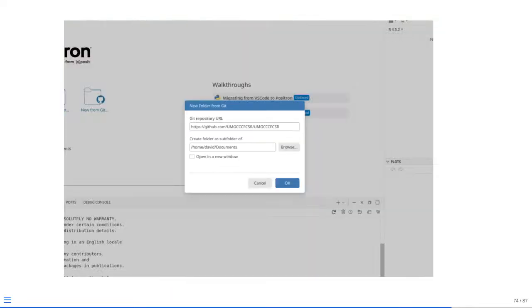And we will proceed to copy and paste that into the GitHub repository URL. The main important thing is you need to decide where you want to keep all your different R project folders, because you're going to be making quite a few of them throughout the course. All my projects are generally under my documents folder.